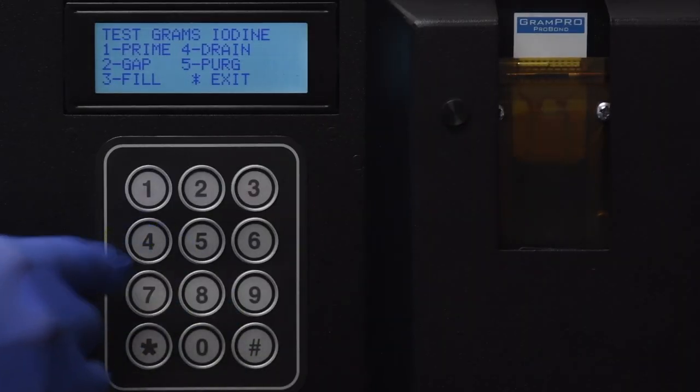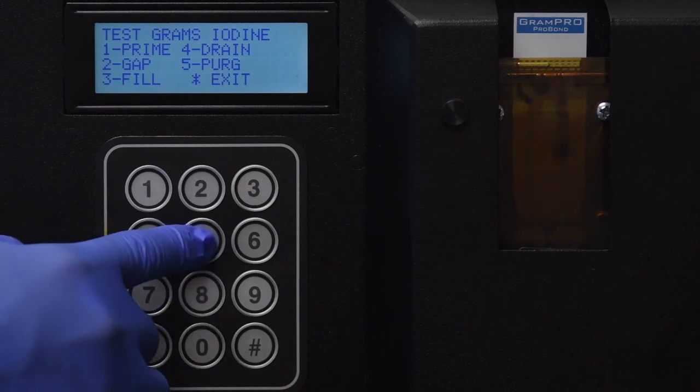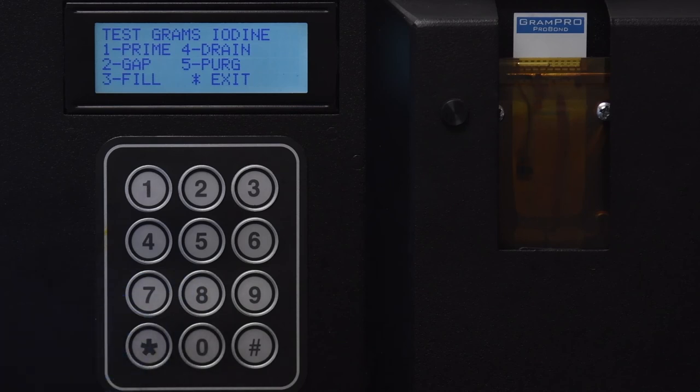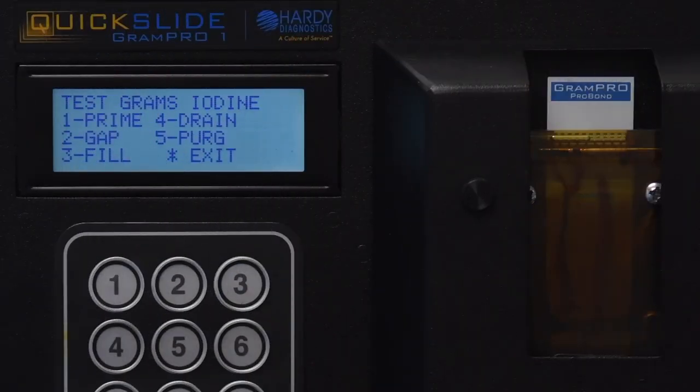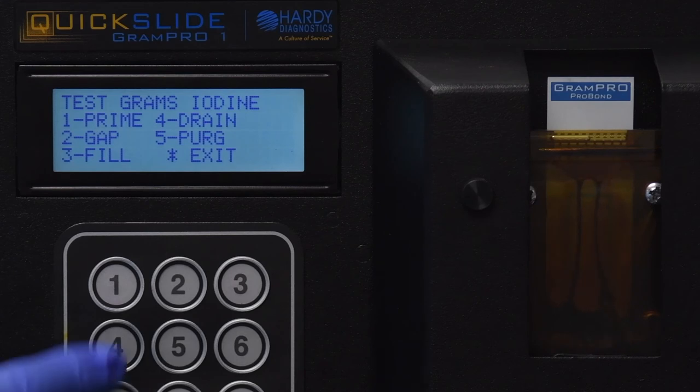Press 6 to select Accept. Press star 2 times to exit back two screens. Press 0 to select Test Calibration, press 4 to select Drain. Once the draining is complete, press 5 to select Purge. The calibrations are now complete.